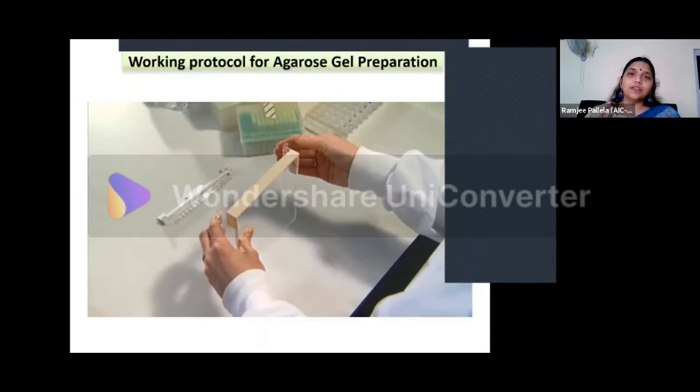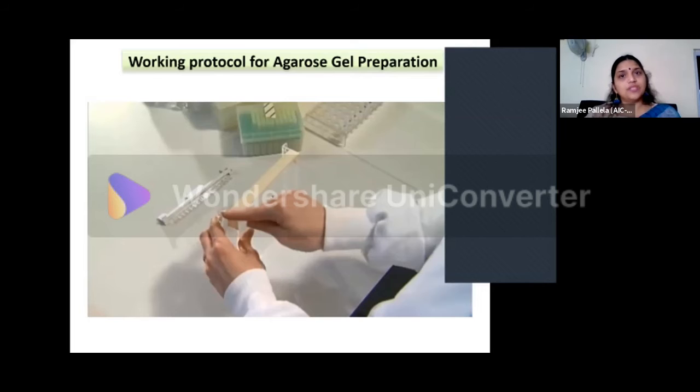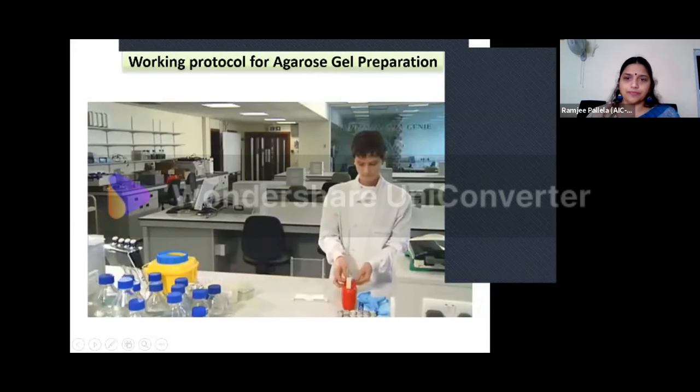Don't feel confused if they show something in the video and what we do is different. It's not like that. I do exactly the same thing. The only difference is I don't use the masking tape. I'm using regular sellotape, the regular sellotape that we get in our laboratories or in the house. The regular transparent tape you can also put. I generally use that. Do the same for the remaining open end.